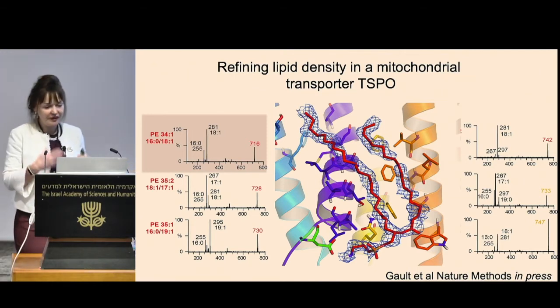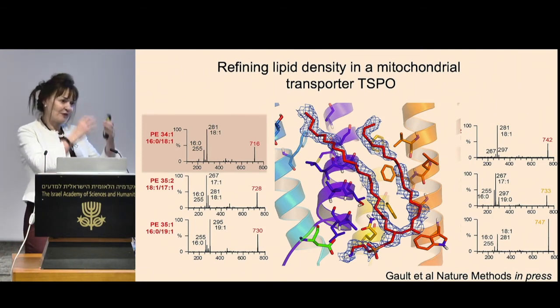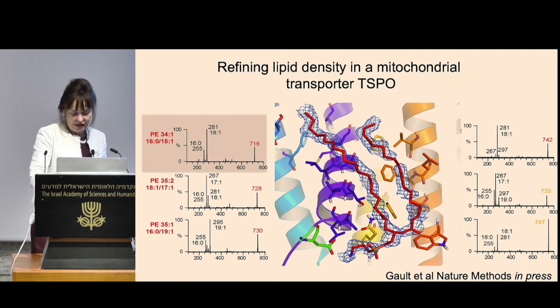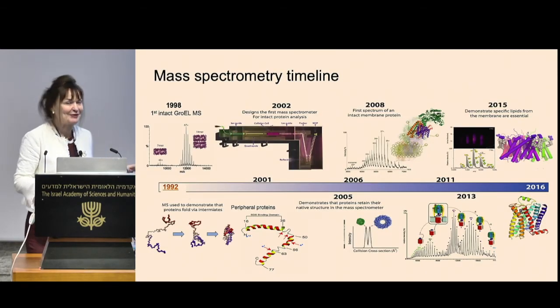So, long story short, that was a proof of concept that we can take this approach and go from a complex to a protein to a lipid to breaking the lipid and then sort of stitching it all back together again. So I'm going to sum up this part, and then I'm going to show you a worked example of what we're doing.